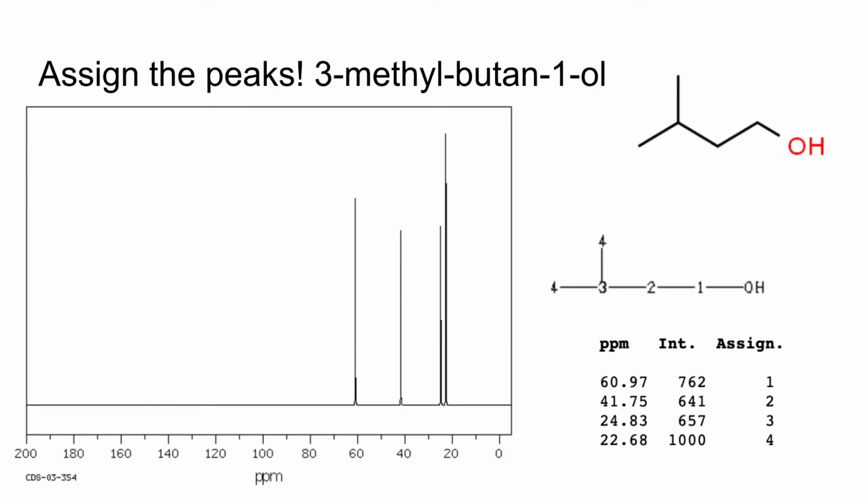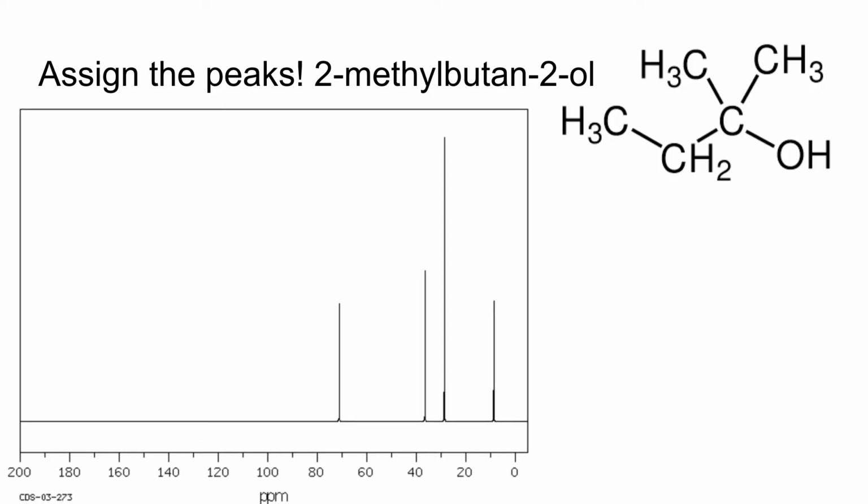Here in the primary case, there are two H's bonded to that carbon next to the OH group, right? It's a CH2 group on that primary. So those H's shelter this carbon a little bit more than when that carbon is a tertiary and those H's are gone and replaced with longer carbon-carbon bonds. So here we've got it more deshielded. So let's go back to classifying the carbons in the peaks. That carbon bonded to the OH is obviously the one at 70 ppm.